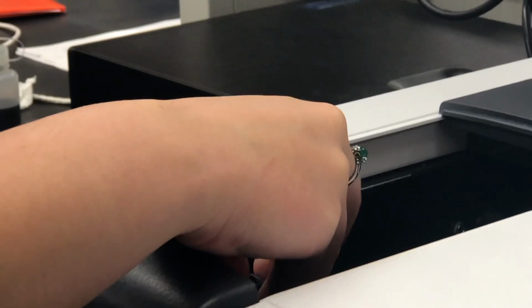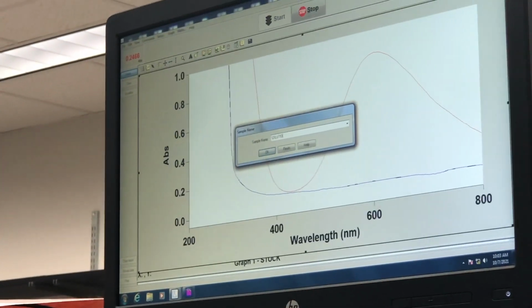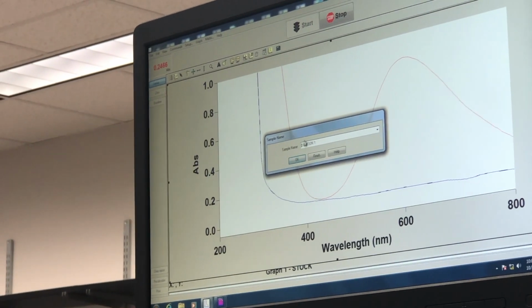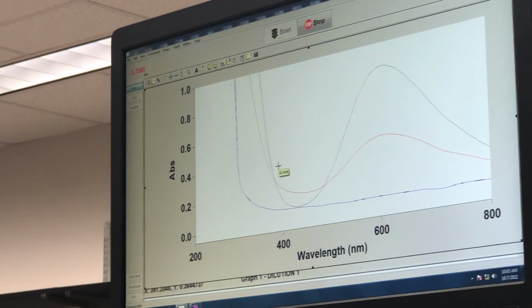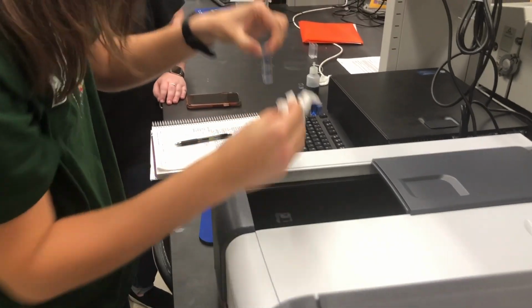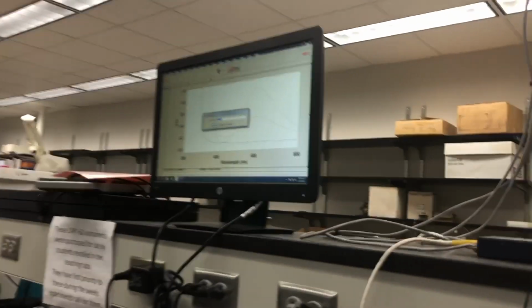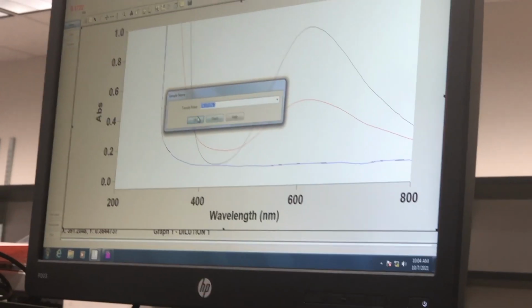In this lab, we have quantitative data and qualitative data. Our quantitative data is the absorbance that was calculated from each of the 3 dilutions. The qualitative data being the color of the dilutions that we made. Although you could compare the colors of each of the 3 dilutions to figure out what the unknown is, it is not very accurate. So therefore, we have to calculate the absorbance of each solution and compare it to the absorbance of the unknown solution to figure out what our unknown substance is.